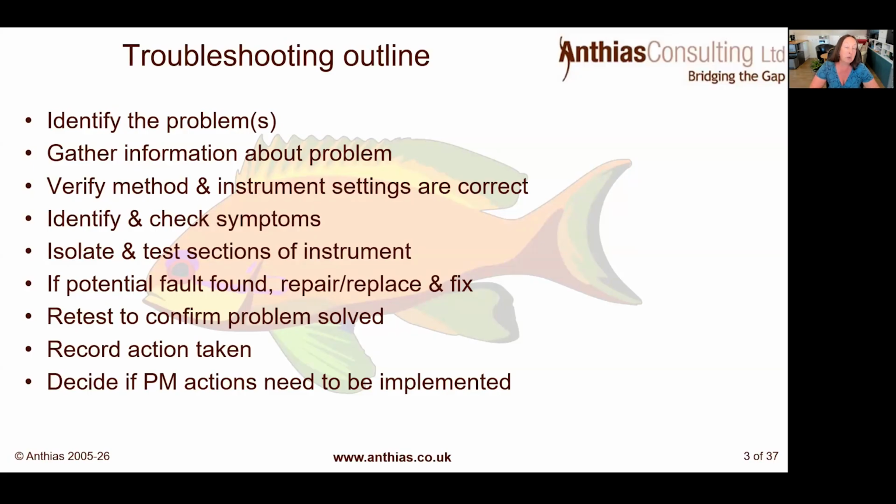So first of all, you always want to identify what the problem is. So is it a real problem? I've seen plenty of people chasing their tails round and round, thinking there's a problem, and it isn't really, it's something else. We want to gather information about that problem. We're going to be talking a little bit more about that in a minute, but we want to gather as much information as possible. Again, it's very, very easy to see one little problem, jump on that, and actually that's not the real problem, that's just part of it. So we want to gather all that information to start with.